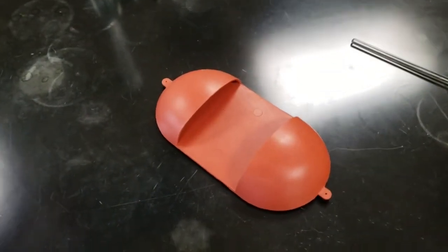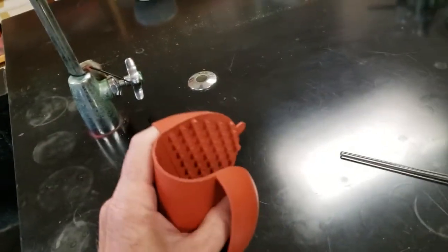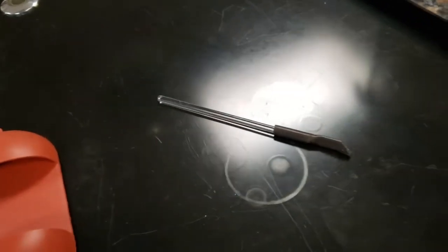This is a hot mitt or a hot grip. You can grab onto it and you can also make a puppet show. So that's kind of fun. And if you have a hot beaker, you can grab it. It freaks you out, but it's no problem.